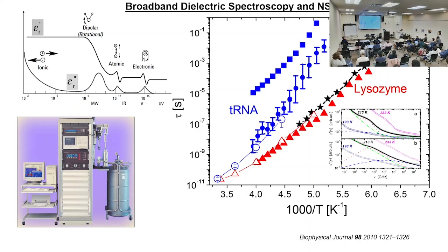And what you measure is the dielectric constant. You have a real part and an imaginary part. Now, if that dipole is part of structural relaxation, then you can actually combine the data with neutron scattering and probably increase your temperature or frequency range. So this is what they did in this work.